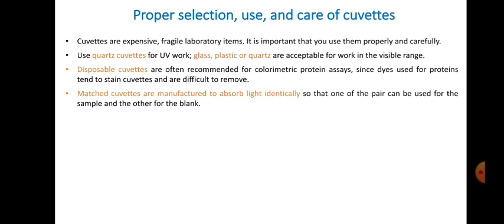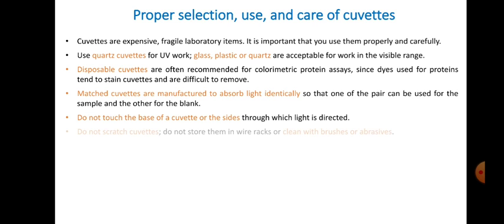Then we need to have matched cuvettes, and they are manufactured to absorb the light identically. So whenever we purchase cuvettes, we purchase them in a pair, right? So that we can match them identically and get results without error. Then do not touch the base of the cuvettes or the sides through which the light is directed. I told you about the transparent surface and the semi-transparent surface, so we should handle the cuvettes by the semi-transparent surface.